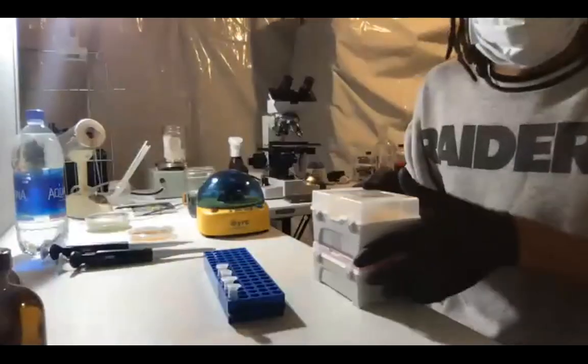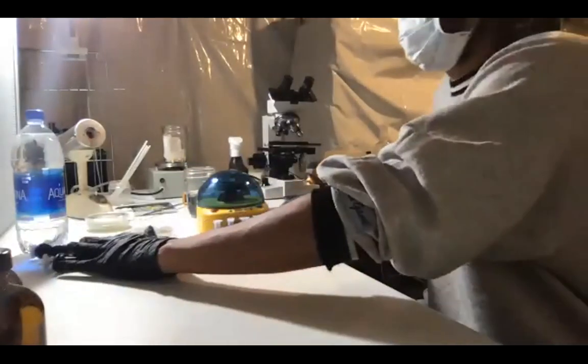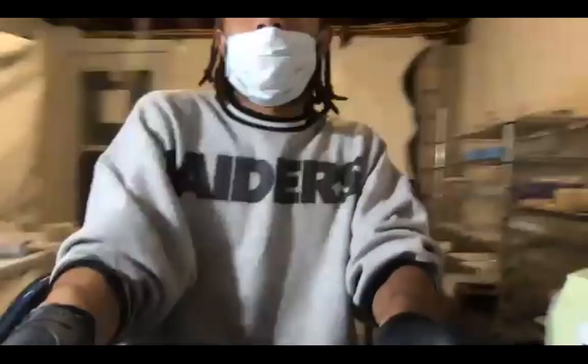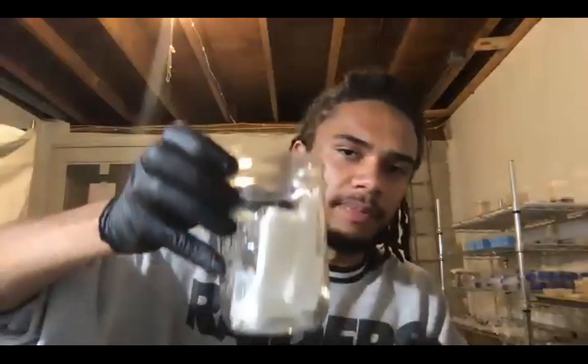So what we're going to do in the meantime is get started on the presentation. And as we're going, I'm going to keep monitoring the temperature on there. As soon as it gets near 95 degrees Celsius, I'm going to start counting for 10 minutes. I'm only using the magnetic stir bar to heat this up right now because I don't want to keep running up and down, because I have my stove upstairs that I will usually do this on, which can definitely get to 95 degrees Celsius. If you put this jar, like a glass, into a pot of boiling water, it works way faster than the magnetic stir bar does.